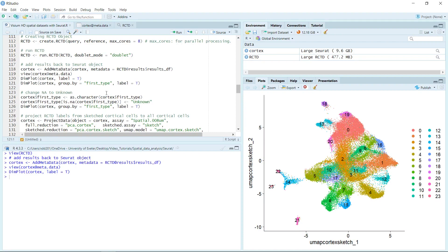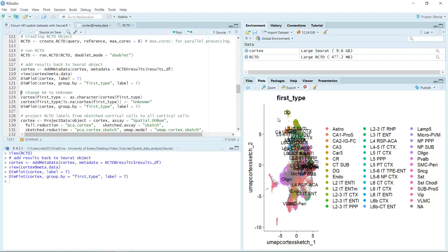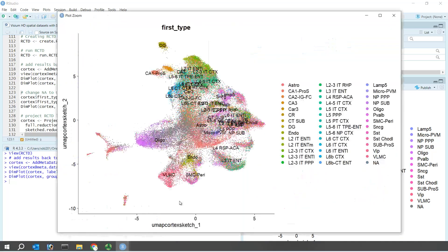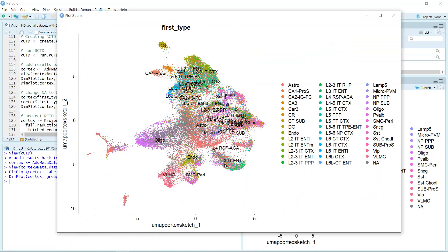Because we have the cell type information in the first type column in the metadata, we can use the group_by function to label the cells. If we run the dimplot plus the group_by function and zoom in, you can see now we have all the cell types information. But at the end, you can see some cells are not labeled — they were named as NA.